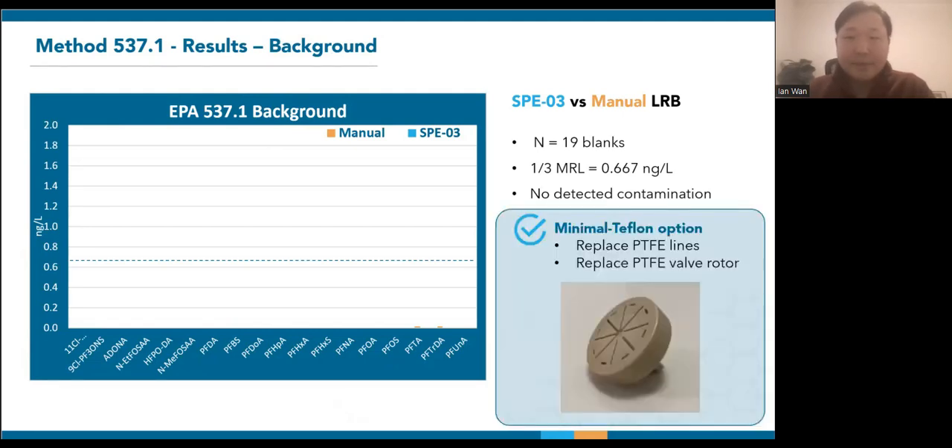The clean background of the SPE03 is achieved through the minimal Teflon option, which is applied to all our PFAS systems. The PTFE lines are replaced by a non-fluorinated material, and our original Teflon valve rotors have been replaced with PEEK.